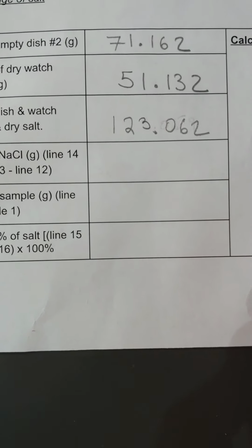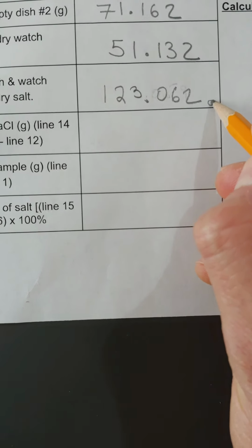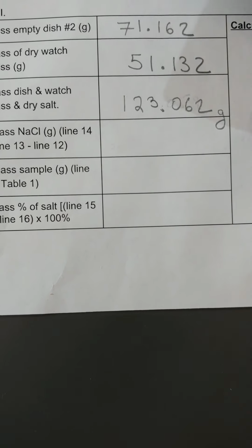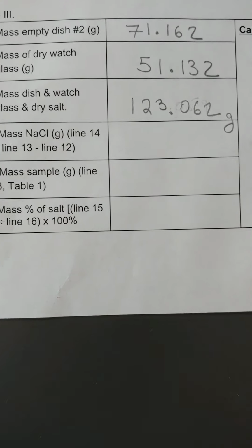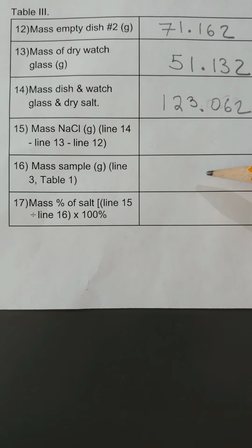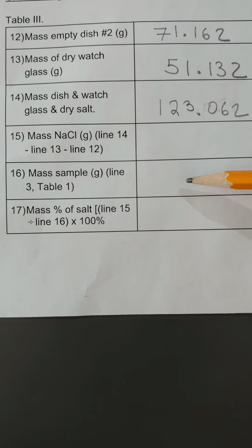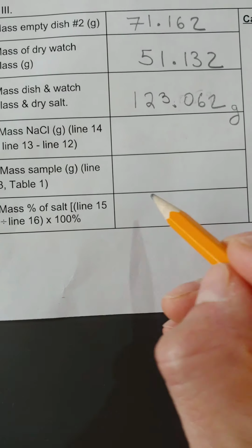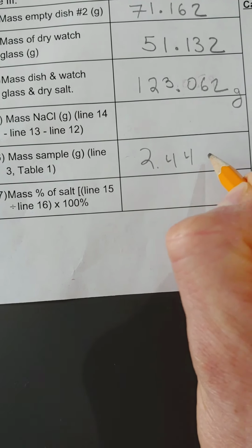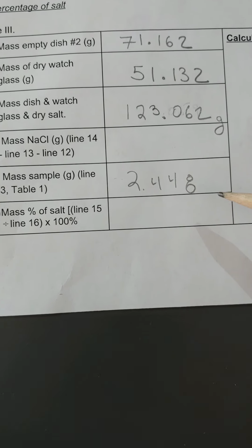123.062 grams, right? And so now we have all the values that we need, and we can go ahead and finish up the rest of the lab. We can figure out what the mass of the sodium chloride is. We can figure out the mass of our sample, well, again, that's the same value from the previous page, right? We started out with 2.448 grams of sample, and we can figure out the mass percent.